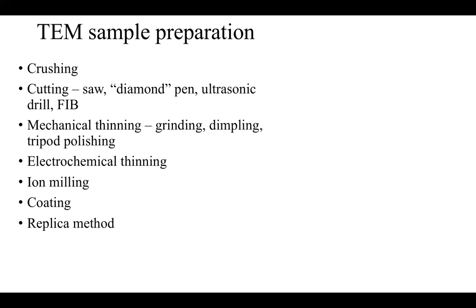Dimpling is a preparation technique that produces a specimen with a thin central area and an outer rim of sufficient thickness to permit ease of handling. So we have a thinner central and thicker outer region so that we can handle it easily.